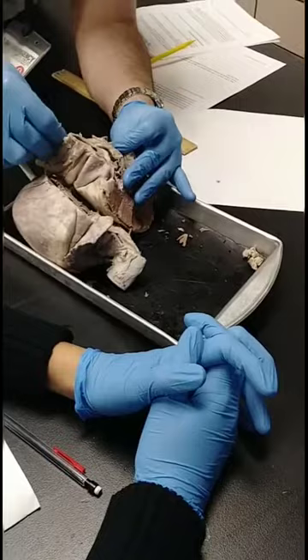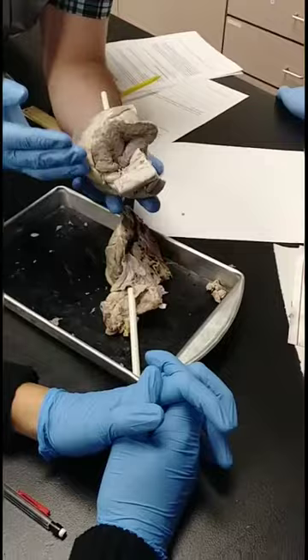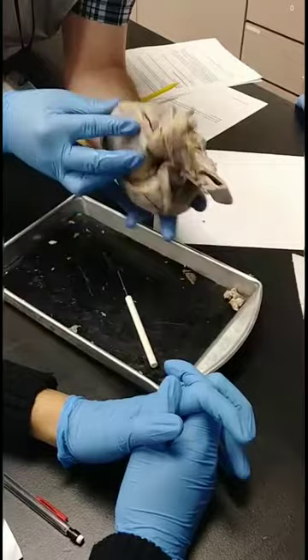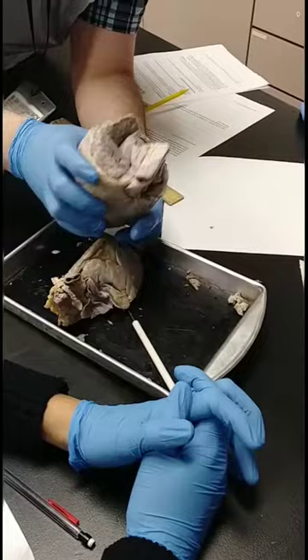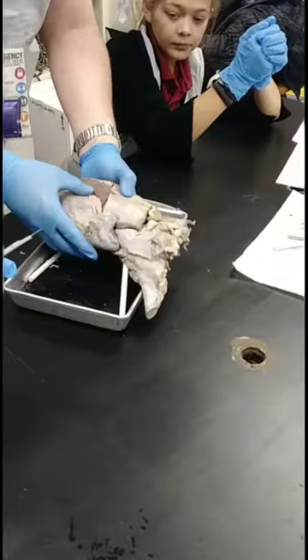Make sense? And these cords go down into the ventricle. The rest of the ventricle is on this side of the heart, because remember, it wraps around. So more of the right side of the heart would be here. Make sense? So this is also the right ventricle. Oh, sorry, the front side, the anterior side. All right, this is all left ventricle.